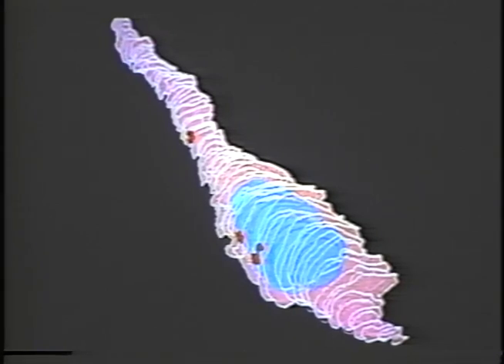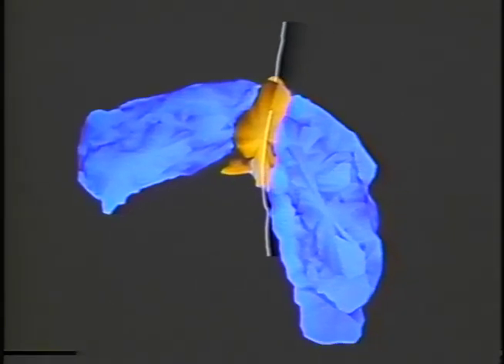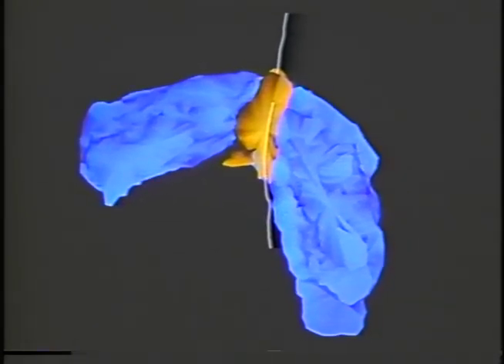The next slide. Here is the next step up in elegance. This is a reconstruction of kinetochore fibers. This is a chromosome with a kinetochore and a microtubule passing through it. This is a reconstruction in which we no longer see the contours. We see a shaded solid.